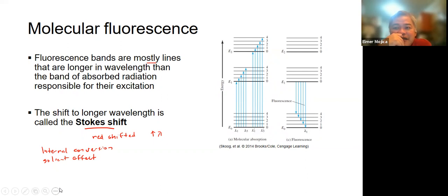What they do is tag a system that is not fluorescent, and they try to monitor what the property of the fluorophore becomes once they tag a given system. One way that they look at this is the so-called Stokes shift, because the Stokes shift will give them an idea of the nature of the environment of the given system. One thing that they use is the solvent effect. And with solvent effects, excited state reactions can also affect the magnitude of the so-called Stokes shift.